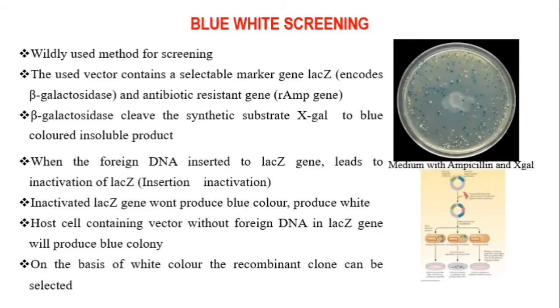In this gene cloning procedure, there is one vector. That vector contains a selectable marker gene, the lacZ gene, and an antibiotic resistance gene, the ampicillin resistance gene.